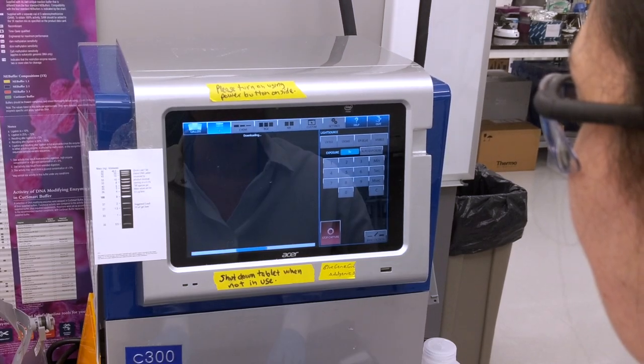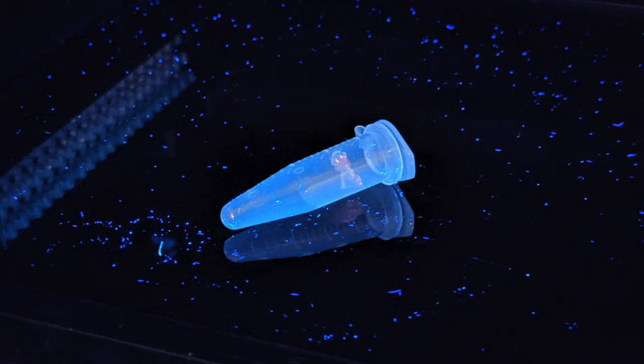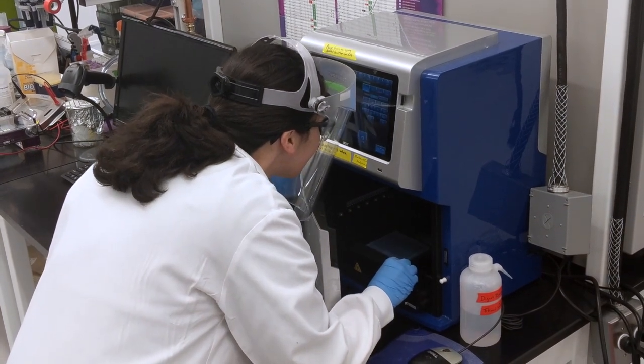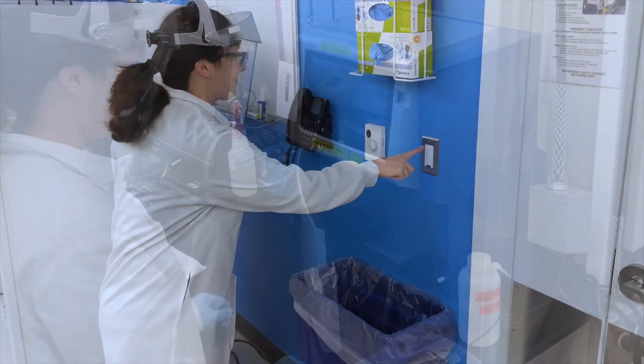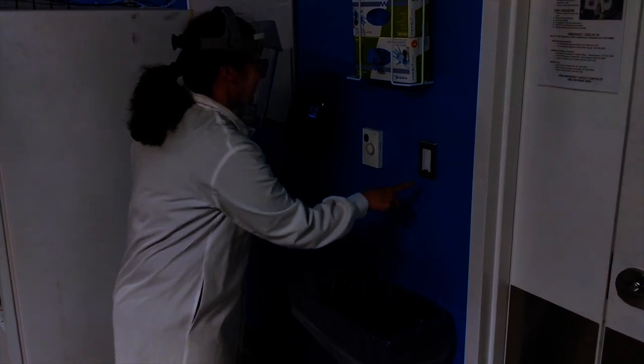The gel we used contains ethidium bromide, a stain that binds to DNA and causes it to fluoresce under the UV light emitted by the gel imager. Pull the tray out slightly to prepare to cut the bands. If the bands are not easily visible, try blocking out surrounding light by closing the shades or turning off the lights.